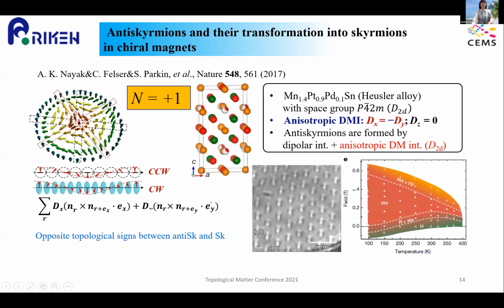And let me move on to the real space observation of antiskyrmions and their transformation into skyrmions, and what time I remain.